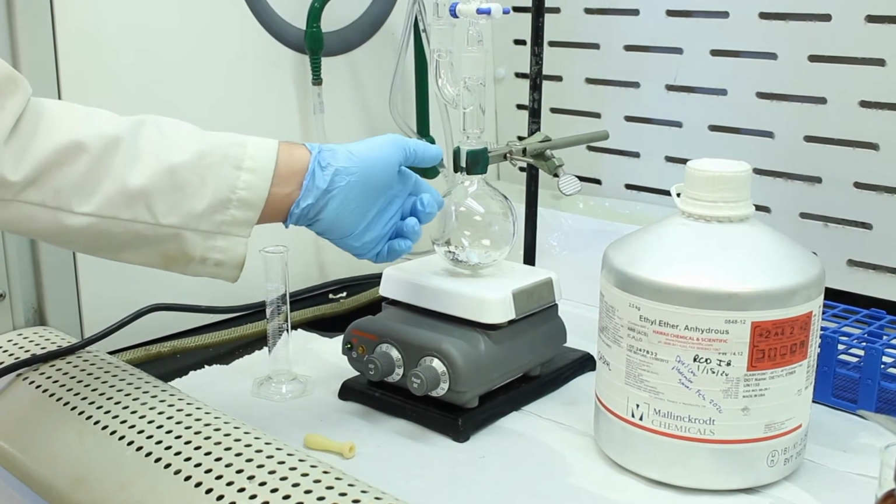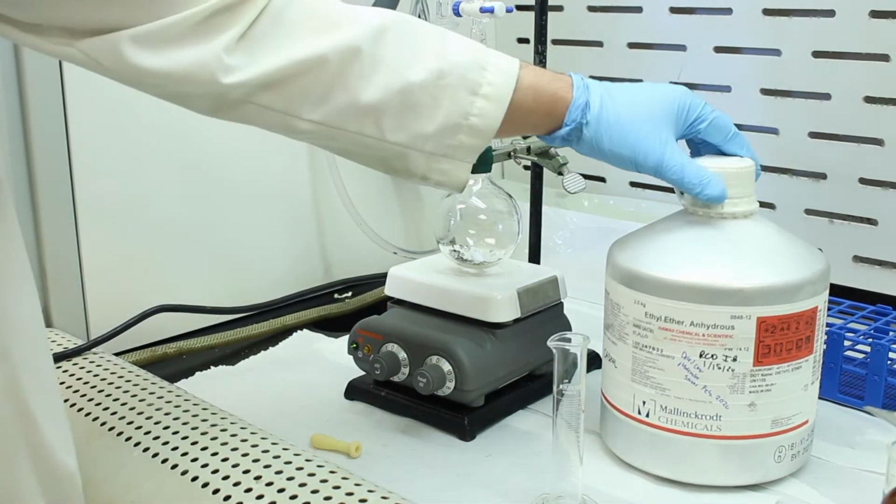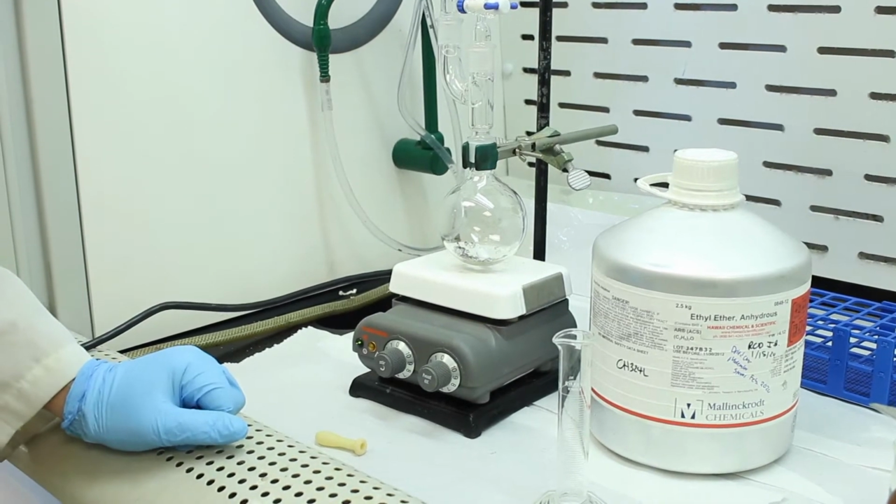So our magnesium is in there. We just need to add our solvent and our halide. So solvent first. We're using diethyl ether. Diethyl ether is inert.